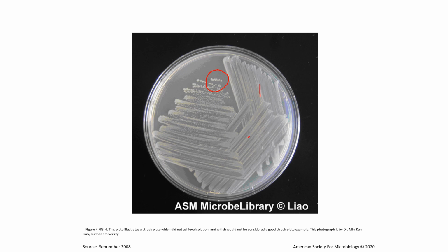Clearly, we have picked up bacteria from the previous quadrants, but we've picked up too much bacteria. So much so that by the time we get here to the end of quadrant 3, we can't really separate the bacteria with the space that we have remaining.